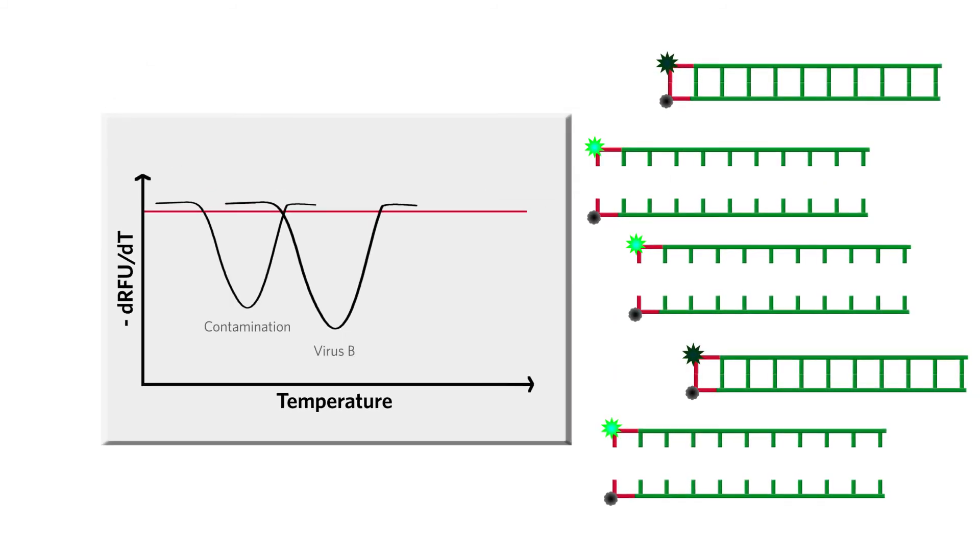This thermal melt curve can act as a quality check. If the curve occurs at an unexpected temperature, something is wrong with the reaction.